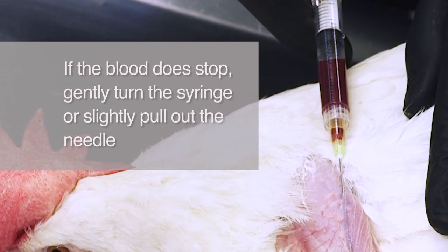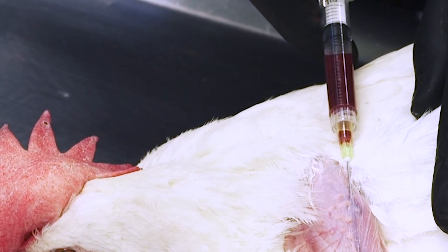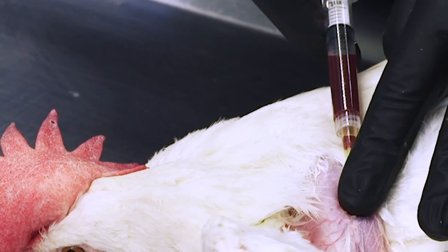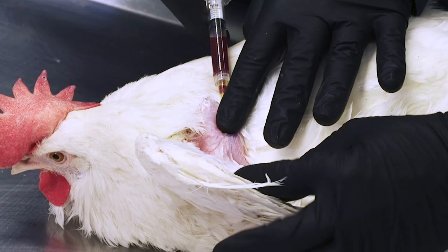Be sure to minimize any sideways movement of the needle. When complete, withdraw the needle and apply pressure to the puncture site for several seconds until clotting occurs. Continue to apply pressure for several seconds. Despite the best of care, sometimes a small hematoma may still occur. This will not harm the animal, but may be a short-term cosmetic problem, especially if the bird is going to a show. The hematoma will harmlessly resolve in one to two weeks.